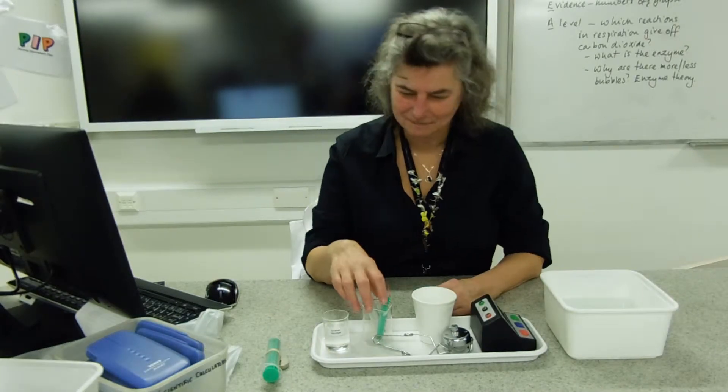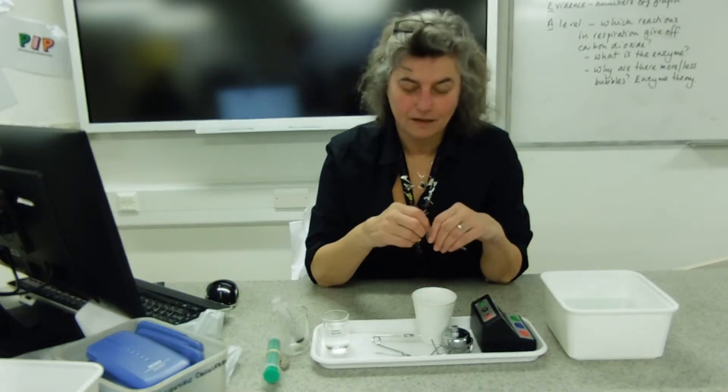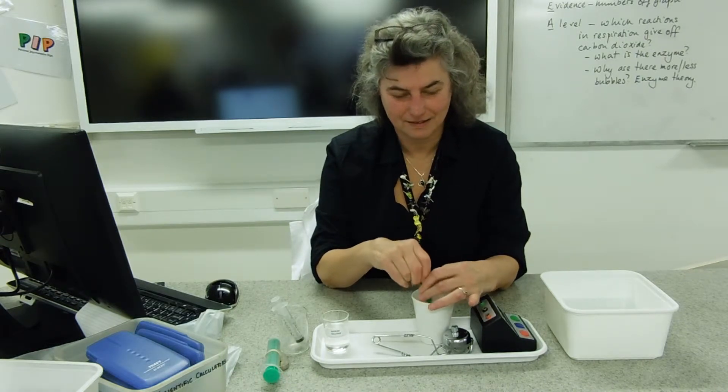This is the bubbly yeast experiment. We're looking at the action of decarboxylase enzymes in this experiment, and the organism that we're going to use — that has decarboxylase enzymes — is yeast.